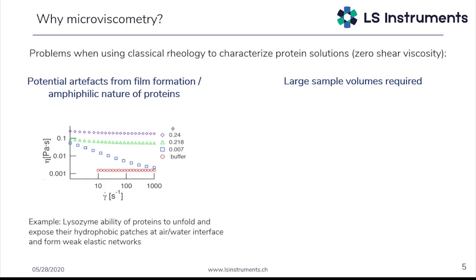And only once we go to very high protein concentrations, the bulk viscosity then starts to dominate what we measure in this mechanical rheometer.